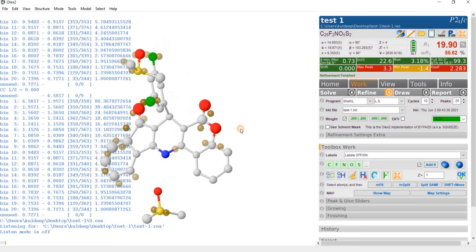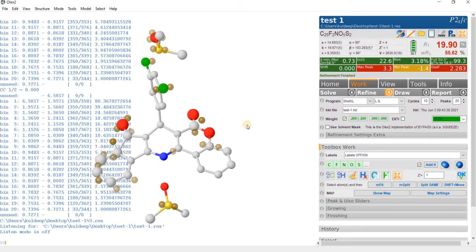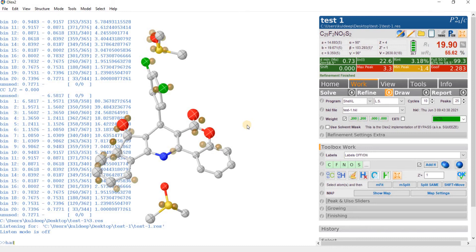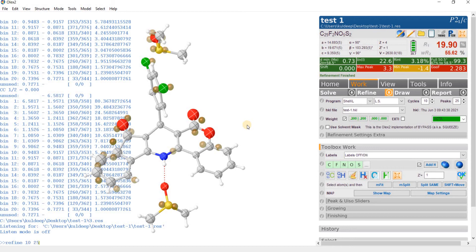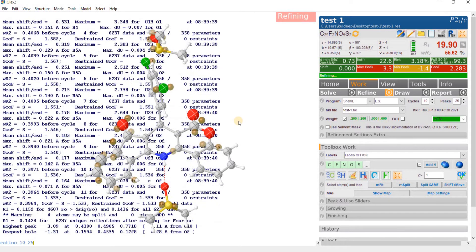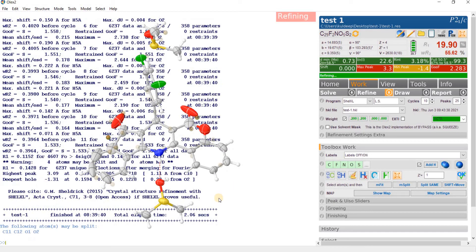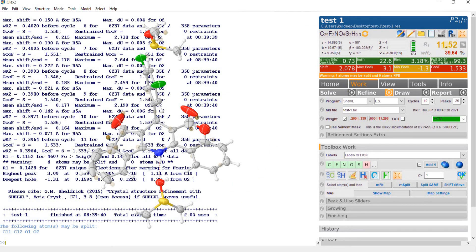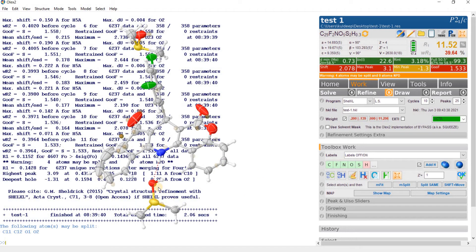For the time, if we ignore this Q peak intensity and refine the model anisotropically by typing ANIS and then HFIX and then L.S. and refine suppose 10 cycle and 25 Q peaks, then what we get? The R factor dropped around 11%.